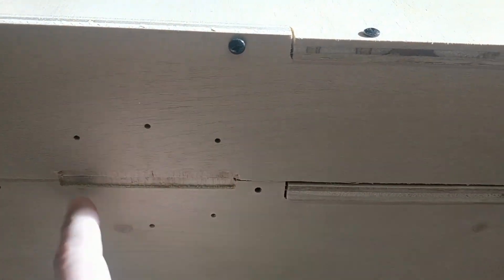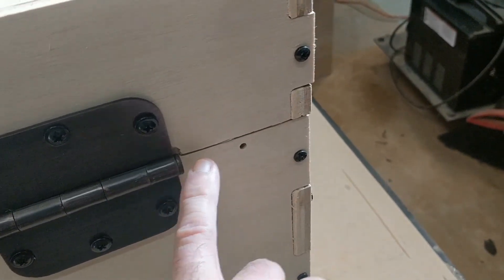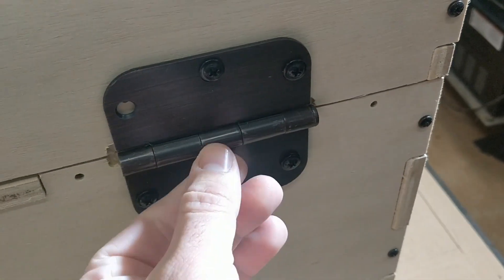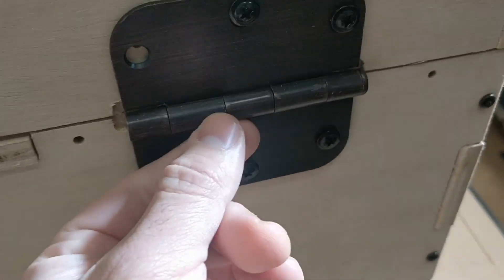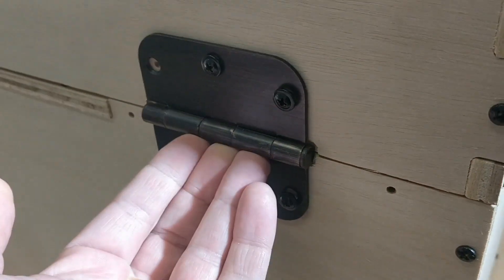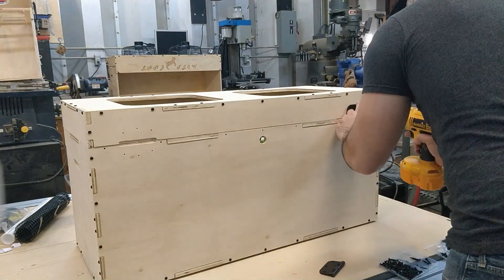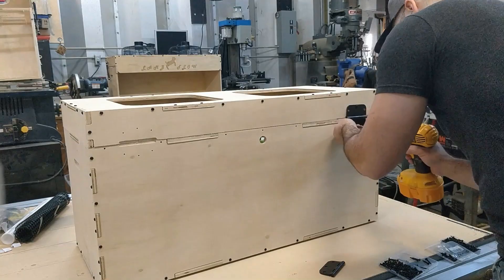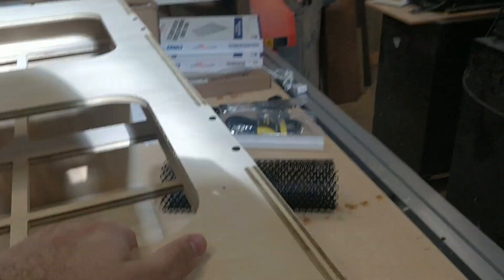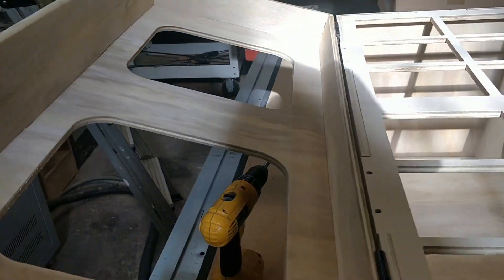Next we're going to be putting on the hinges. On the back there'll be six pre-drilled holes with a notch, and that notch is where the pin goes on the hinge. Try to orient the head of the pin to the outside — that makes the hinge fit better. Keep it loose while installing so you get all the screws in, then orient the hinge in the correct place in that notch, lift it slightly, and tighten it down. Hold off on installing the spring dampers so you have more access to the underside of the lid.